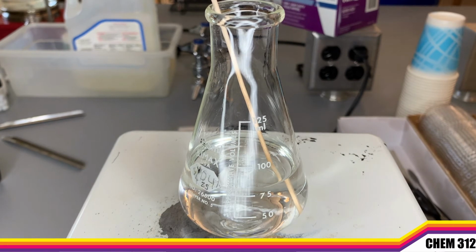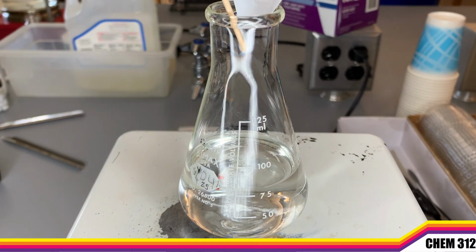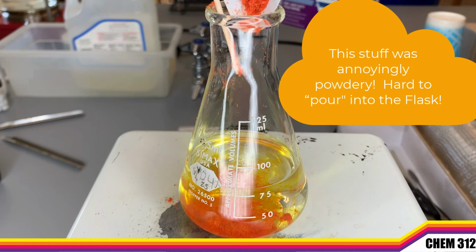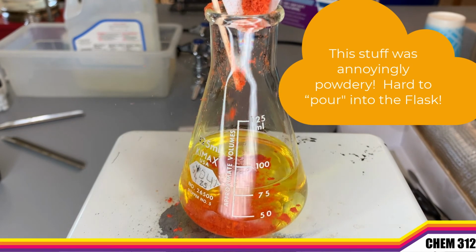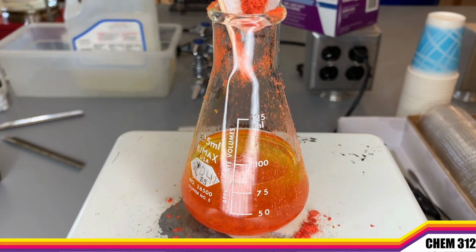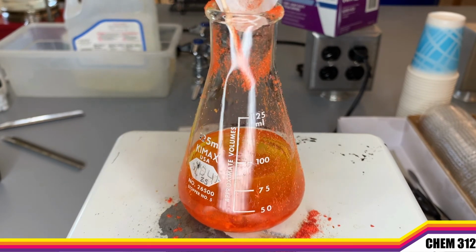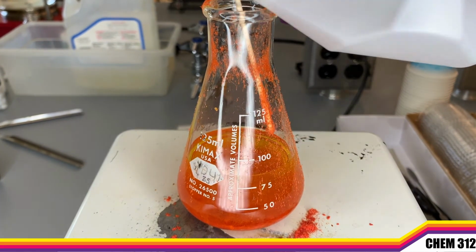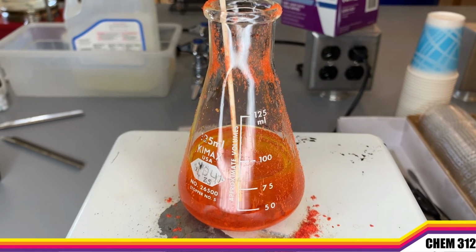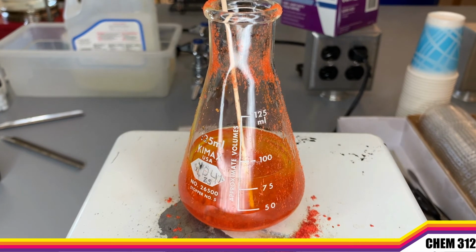I have some ethanol that's being heated here on our hot plate. I'm going to add in this imine complex that we made, hopefully getting as much of it as I can in there. That's 978 milligrams, or 0.978 grams. We're going to let this all dissolve and then cool back down slowly.